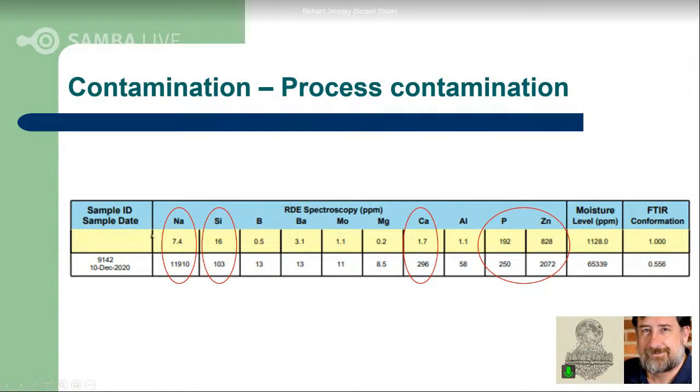Yeah, Richard, it's a great case. In the pulping industry, you have process fluids called liquor, black liquor, white liquor, and so forth. And I think this really goes to, again, not trying to do lubricant analysis in a vacuum. Understand as much as you can about the application and the environment that the equipment is sitting in. Sometimes it's a good idea to tell somebody, when you go to take the sample for me, sweep a little dust up off of the floor, put that in a bottle, and let me look at that as well, because it might give me some indications of what types of elements are there and in what ratios.